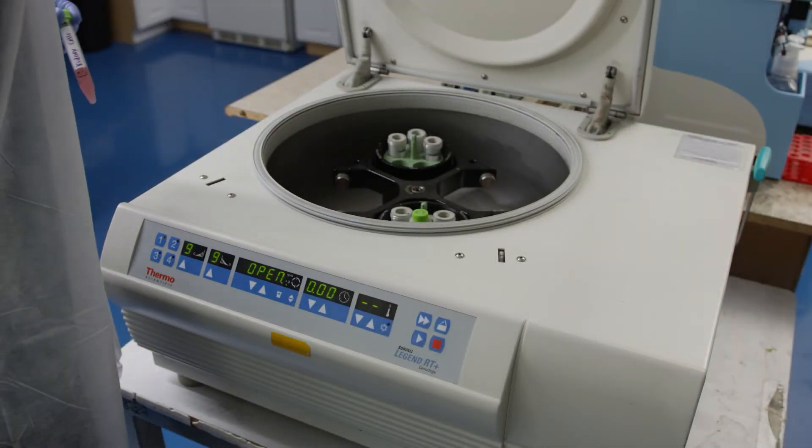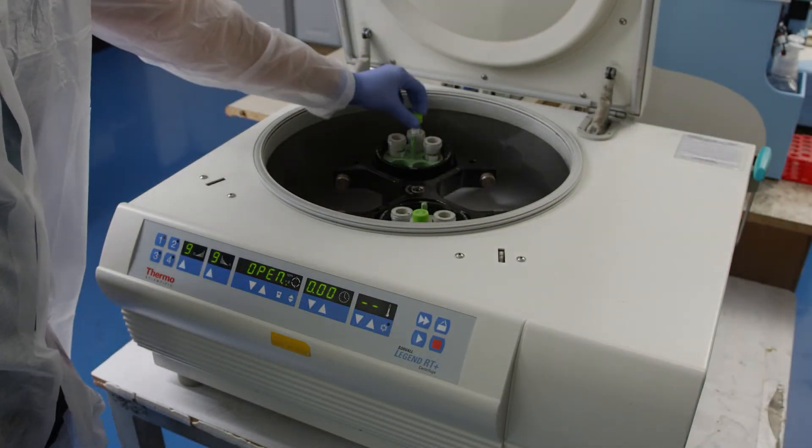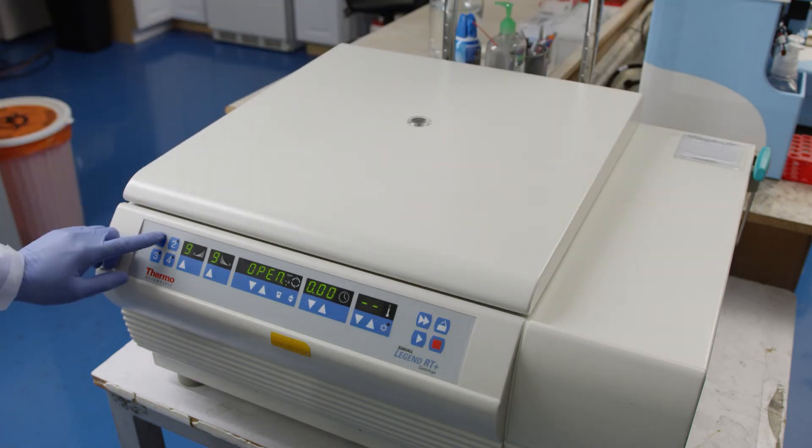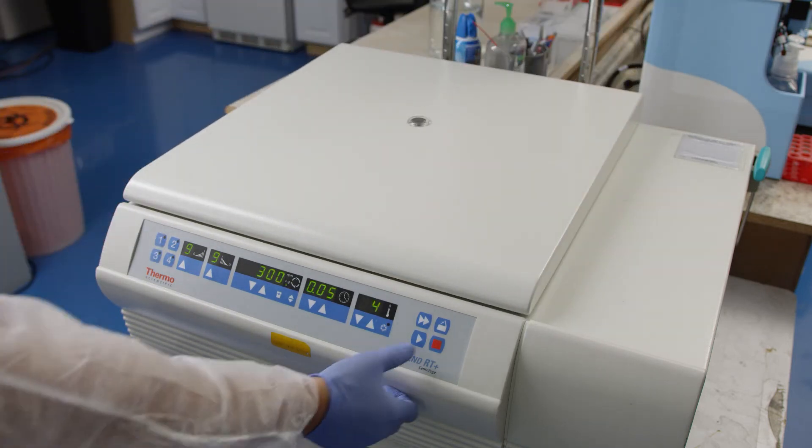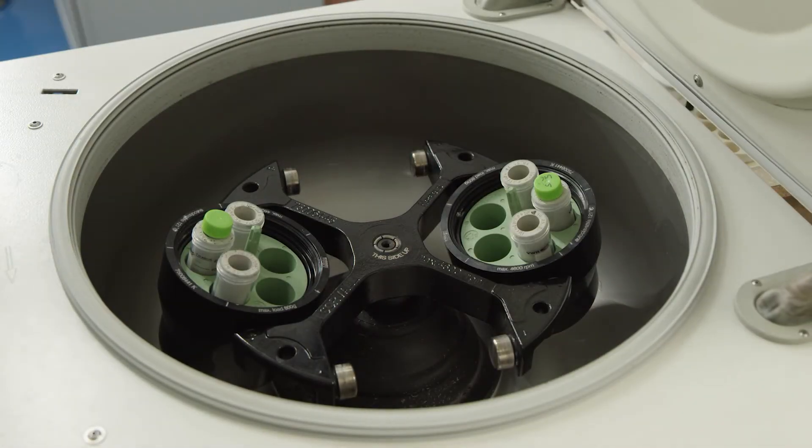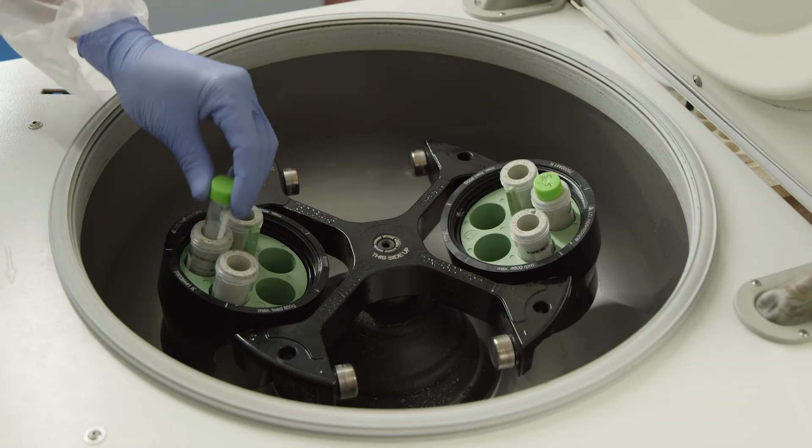After transferring the cell suspension to a conical tube, centrifuge the tube for 5 minutes at 300g and 4 degrees, or at a speed appropriate for your particular tissue. After centrifugation, carefully remove the supernatant without disturbing your pellet.